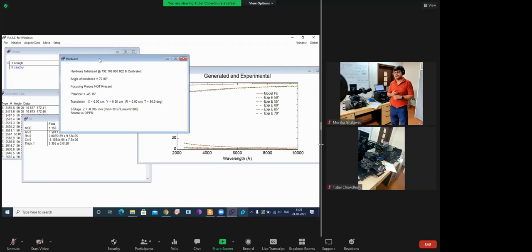Okay. Who is the student? So Shifali. Ah, Shifali, I can recognize your voice. Okay. Back to Monica. In maths we generally use polynomials, so it is just constant values to fit our graph. That's it. Okay. Ma'am, just one doubt.